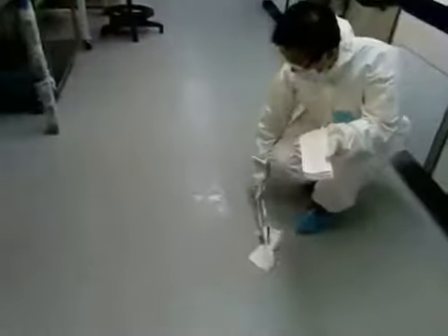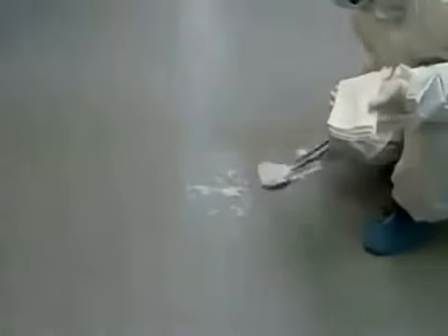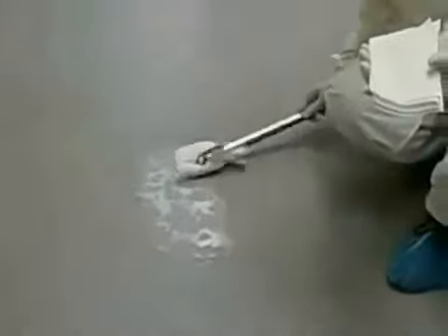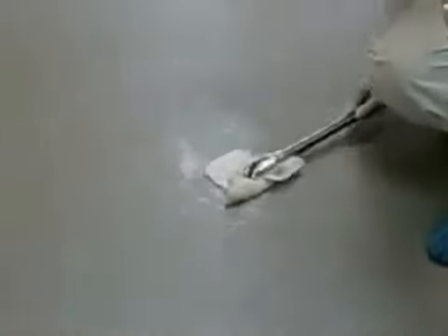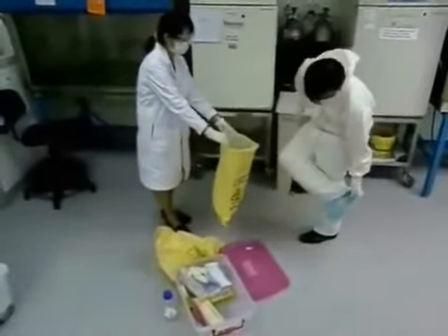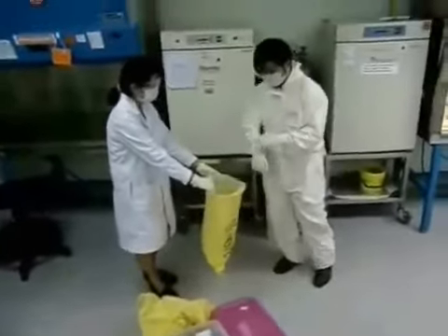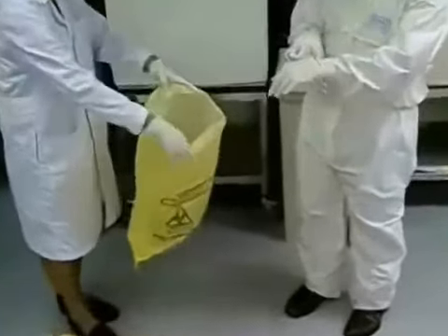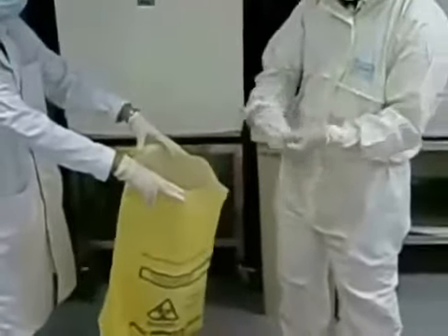Absorb any residual disinfectant with absorbent paper towels and dispose them into a biohazard bag. Once the area is clean of all visible contamination, spray the area with disinfectant and allow it to air dry. When finished, carefully remove your PPE: removing the shoe covers first, followed by the outer gloves, lab coat, inner gloves, and face protection.